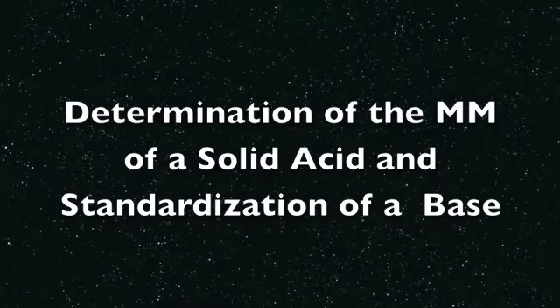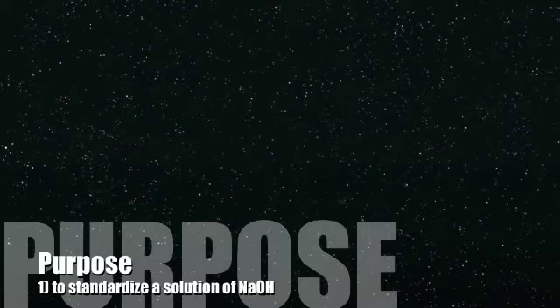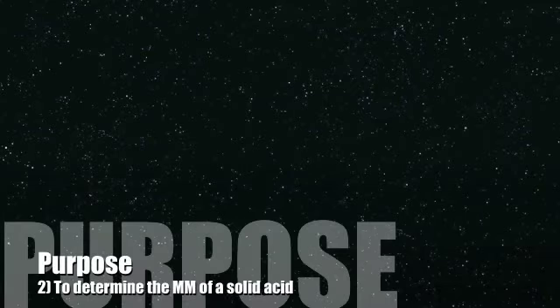Today's lab is the determination of the molar mass of a solid acid and standardization of a base. The purpose of this lab is to be able to standardize a solution of sodium hydroxide and also to determine the molar mass of a solid acid.